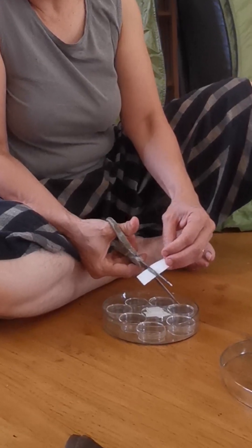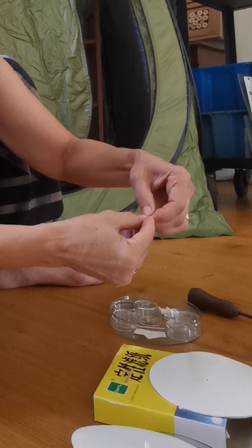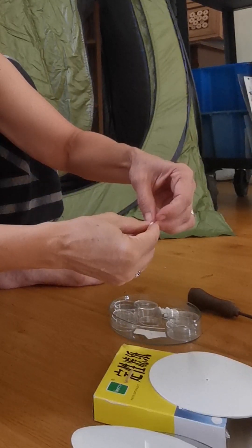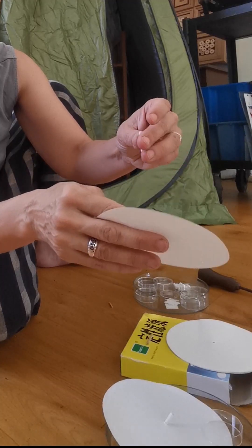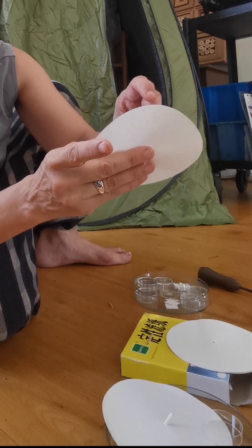Then you prepare your wicks — two by two centimeter squares cut from a filter. You roll them up and place them through the hole in the middle of the filter. You make the hole with an awl.